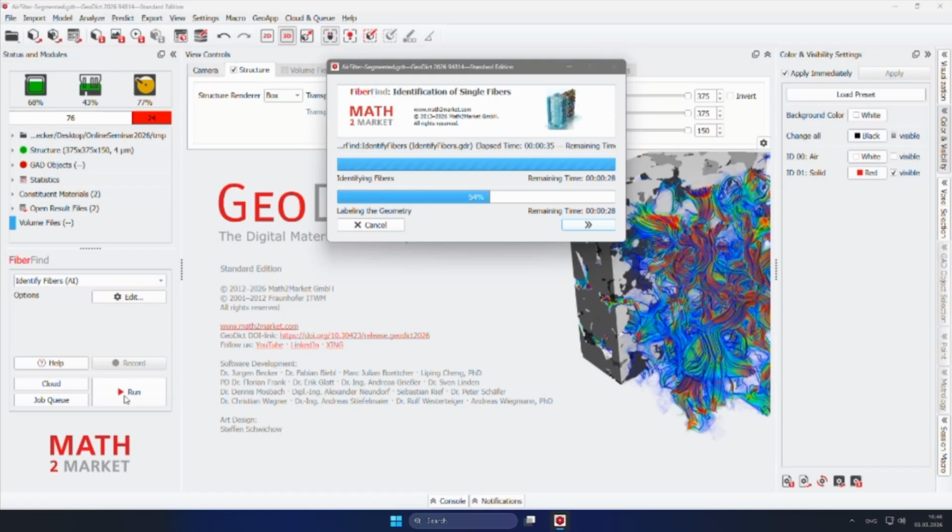And then we trained the AI to find the individual fibers in these meshes. And this AI can now also find the fibers in segmented 3D images. And why is this useful? Well, once we have identified single fibers, then again we can analyze these fibers for the diameter, for the orientation distribution, for the curvature, and so on. And these are exactly the values, of course, that we then need to rebuild the structure virtually.